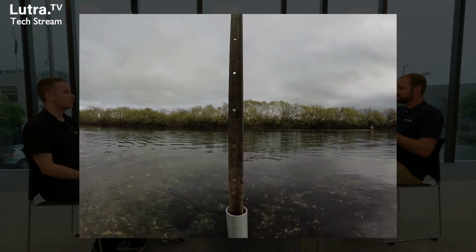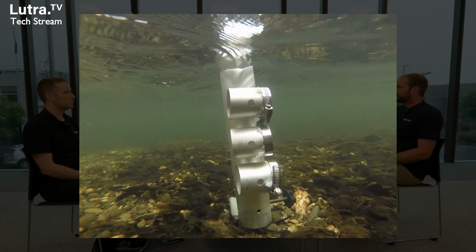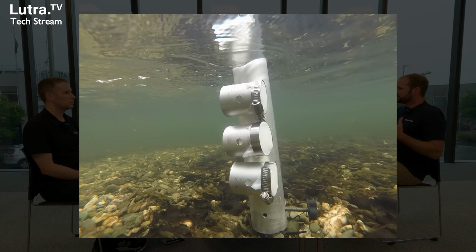Yes. And what we might do in that scenario, because the cyanobacteria themselves are unlikely to be getting through all of the sand and soil to get into your groundwater supply, we'd be looking for the toxins there. And we'd probably use a technique that we call SPATT sampling. Basically this is a resin which we put in a little net and we drop it down into the water supply, and that resin starts to bind up the toxins.